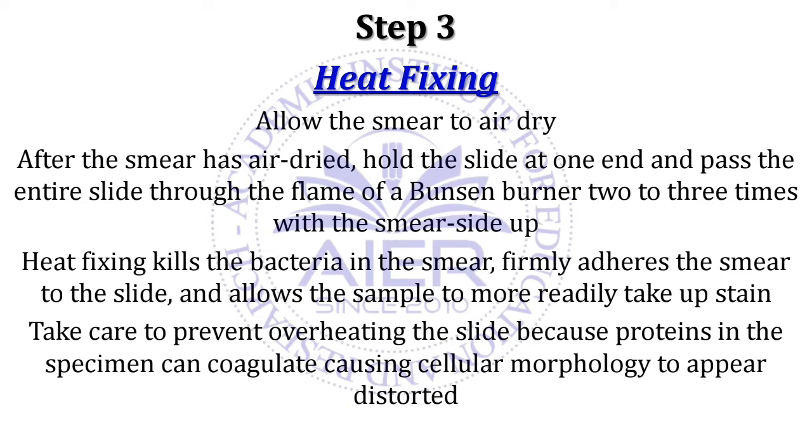Take care to prevent overheating the slide, because protein in the specimen can coagulate, causing cellular morphology to be distorted. So excess heating should be avoided.